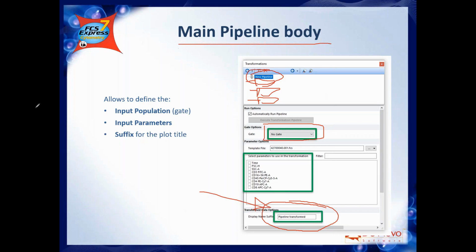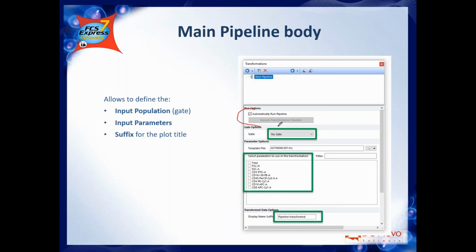I should have said that through this dialog you can do 4 stuff. This one is pretty useful. Everything in FCS Express is set to live update. Every tiny change, every time you move a gate, every time you change something in this dialog, triggers FCS Express to live update.